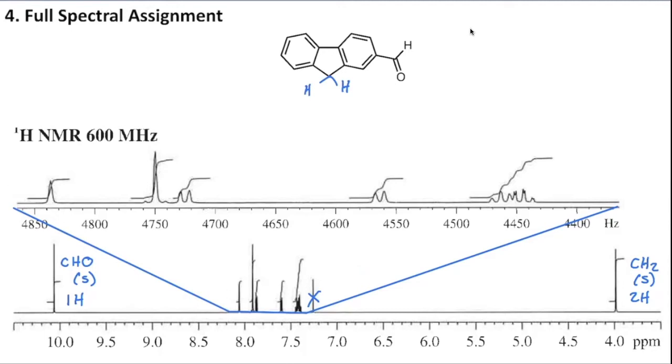And if you see something that doesn't seem to be labeled, that doesn't seem to match up to anything on your spectrum, just do a quick sanity check and say, is that my solvent? Chloroform comes in at 7.26 ppm every time. So if you see a peak there that doesn't quite make sense, it's chloroform. I've tried to do my best to label all of those solvent peaks for you in your post-lab assignment, so hopefully there is no confusion.